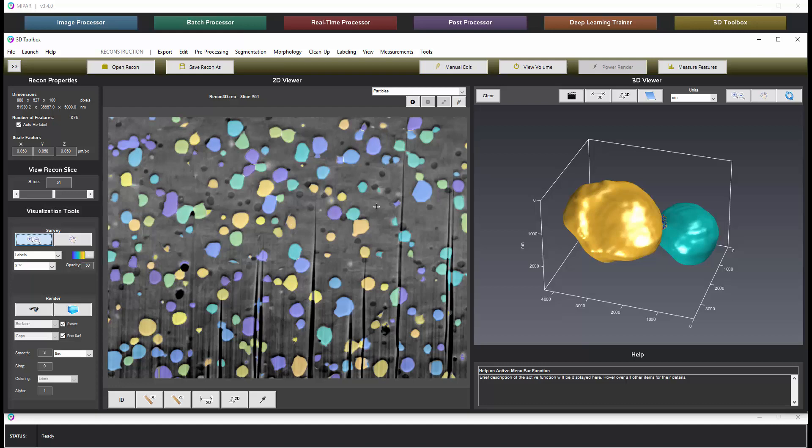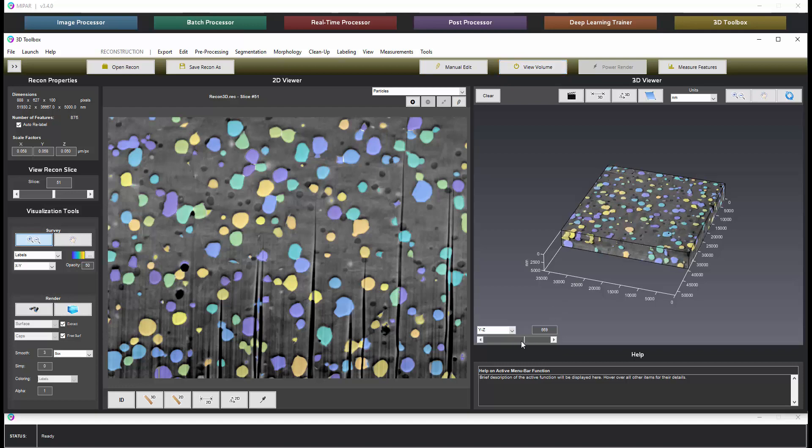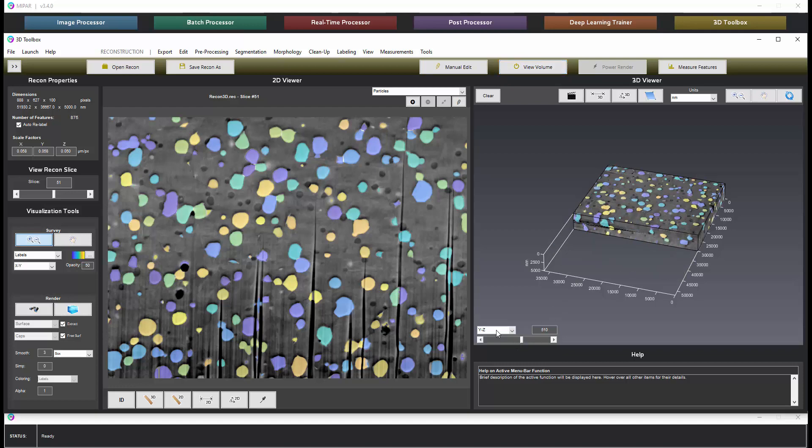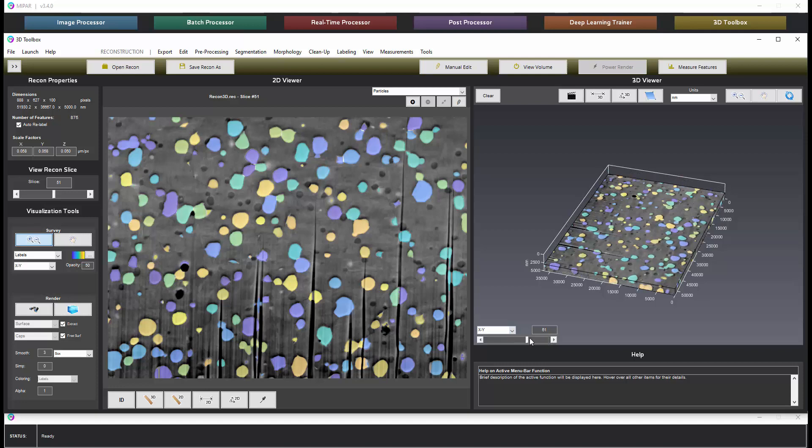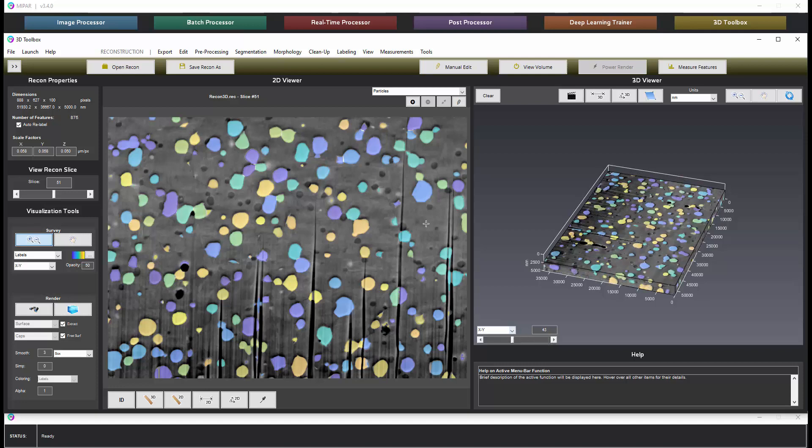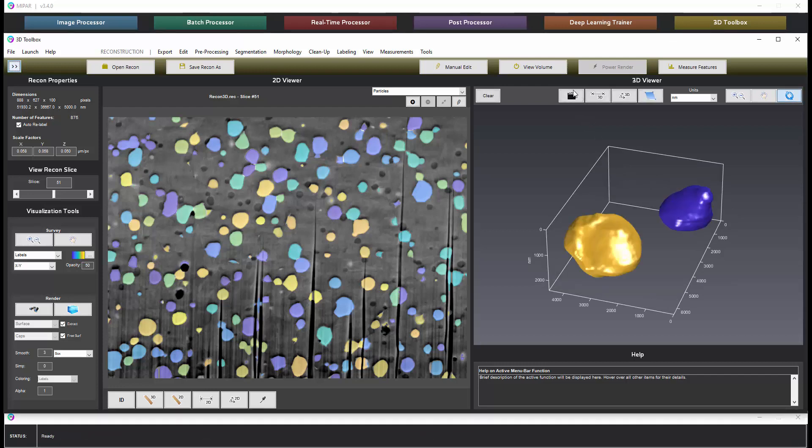If you were to click the binoculars it would render a full rendering of all particles in 3D. Animations like rotation or even slice through dimensions with a visualization like this, a slice animation like this or like this, as well as a rotation animation of 3D reconstructions such as this can be made by clicking the movie icon and following the steps within.